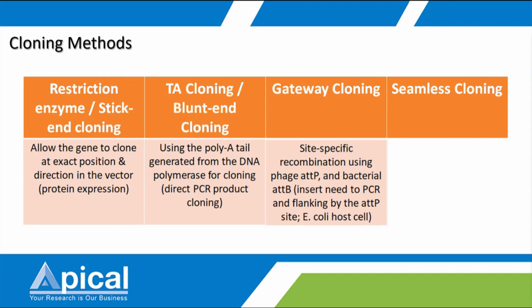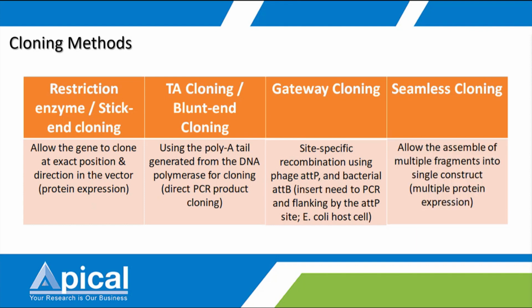And seamless cloning will allow you to assemble multiple fragments or genes into one single construct. So this is suitable to be used for multiple protein expression study. For today's webinar, we will focus more on sticky end cloning and also blunt end cloning.